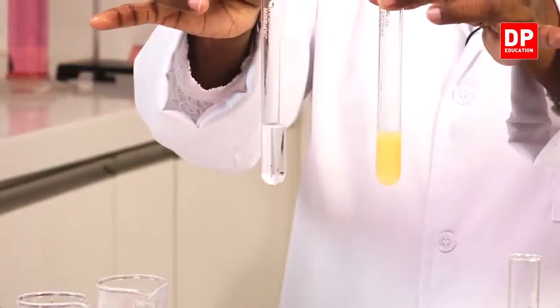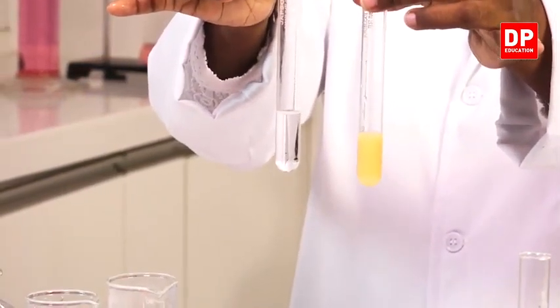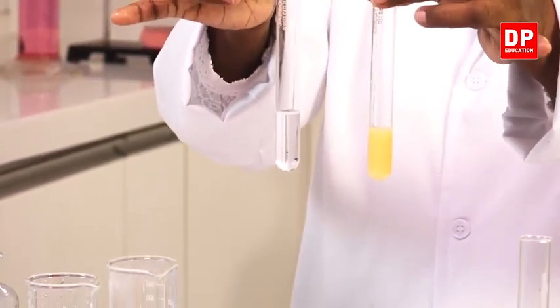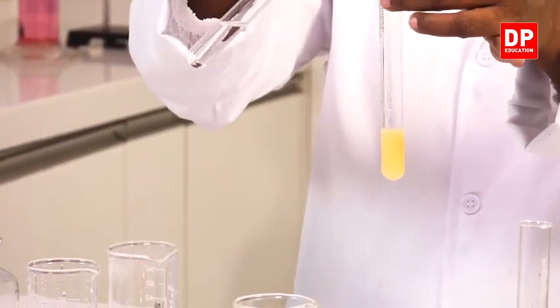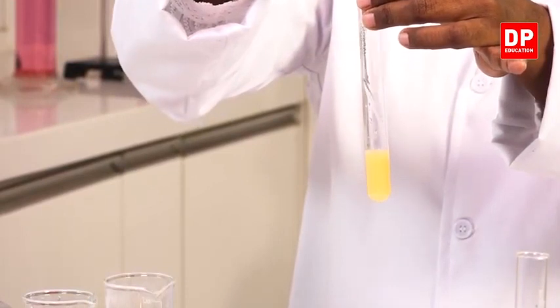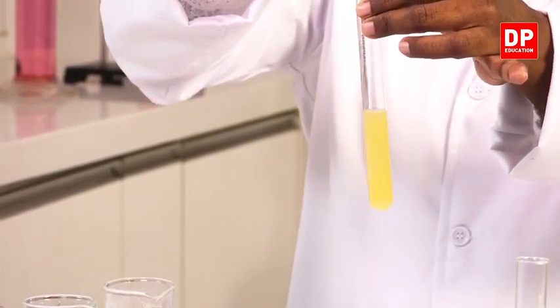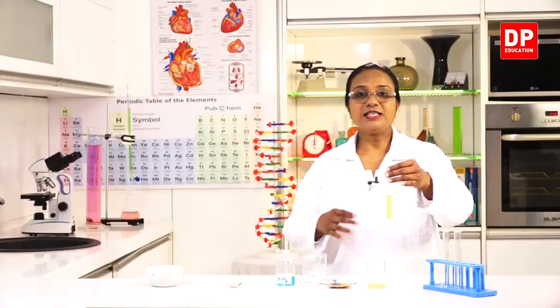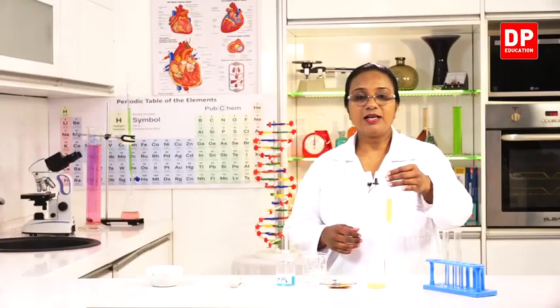Here you can see I have taken slightly more sodium hydroxide than the dal extract. Now, I will transfer the sodium hydroxide into the dal extract. You can still see the color of the dal extract.